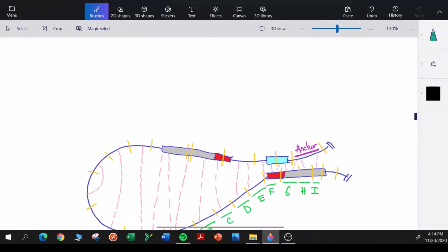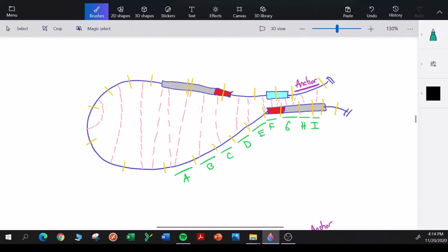So, back to the hypothesis, right? I have this model diagrammed again, showing the KLK2 or KLK3 enhancer in close proximity to the KLK2 gene promoter right here.